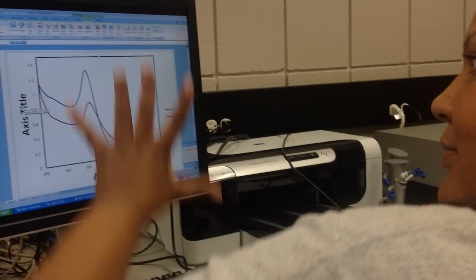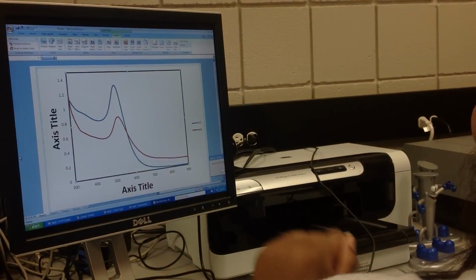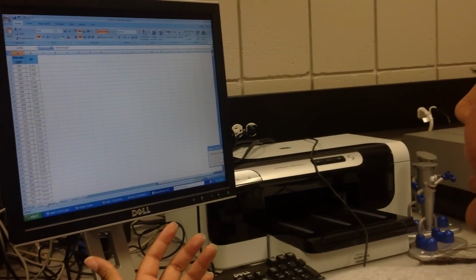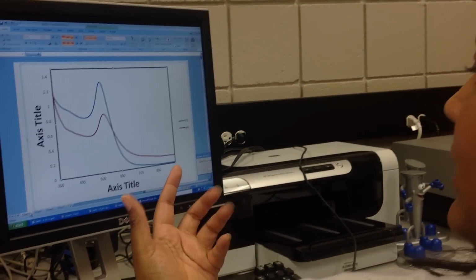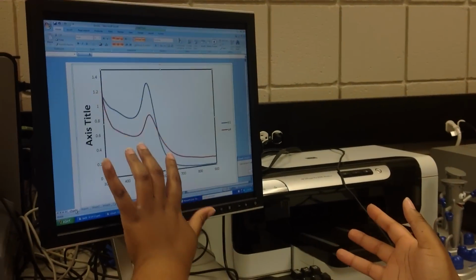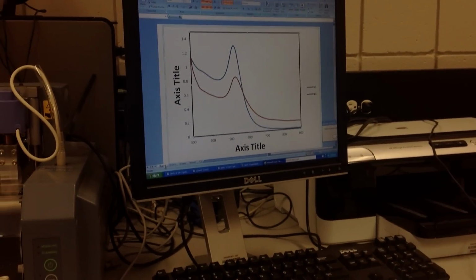You can make yourself a template. So now you can save one file so that every time you compare a set of goals, all you have to do is take that data and paste it on top of this area so it'll automatically populate in your chart. You can also copy this chart and paste it, take some of these spectra out and put new ones in, so you can get a different view to compare by.